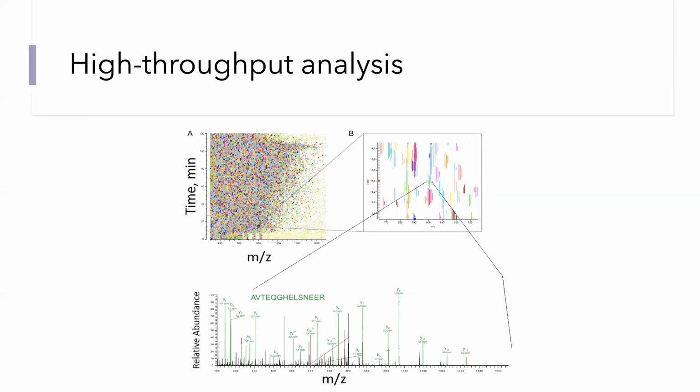As I said from the very beginning, mass spectrometry is not a single method, but a very large collection of methods, even when applied just to proteins and peptides. So there are many different variations of the method that is outlined in this slide, but they share similar principles: in general, we want to separate the analytes in time, usually done by chromatography, and then analyze smaller subsets of the analytes at a time so that we can determine their chemical composition.